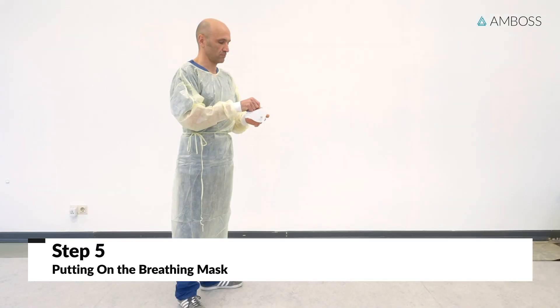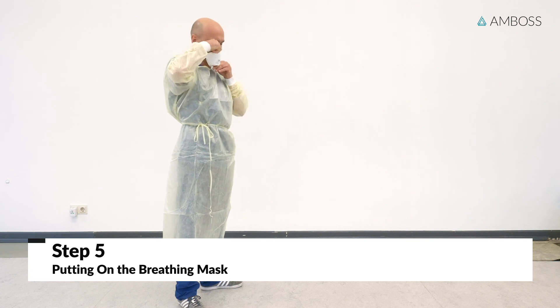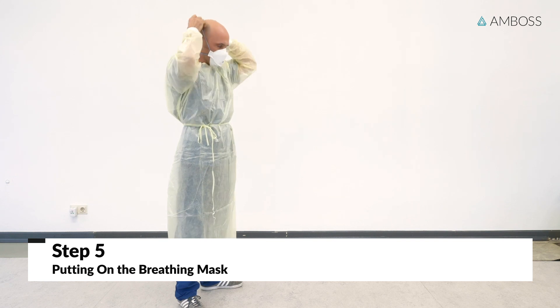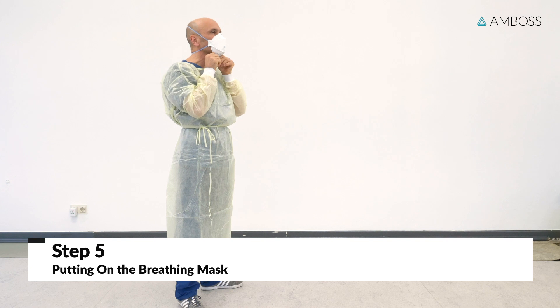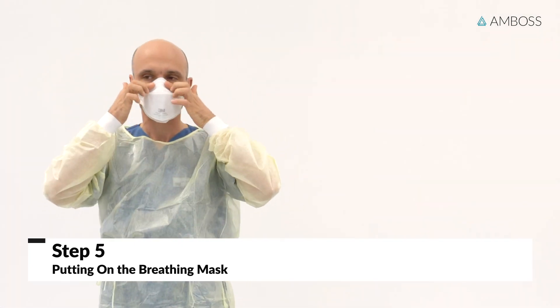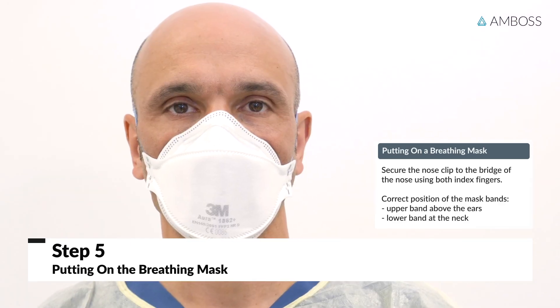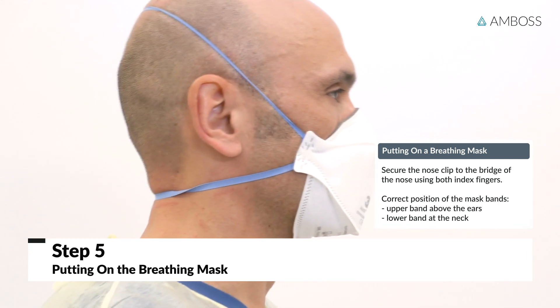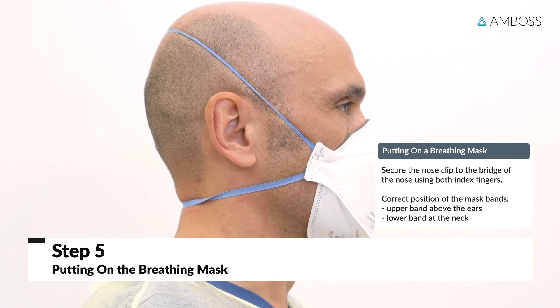Daniel will now show you how to put on the breathing mask. The respirator shown here is an N95-equivalent mask. First, put on the mask so that the nose, mouth, and chin are completely covered. Next, the nose clip should be fitted to the bridge of the nose with both index fingers. The breathing mask's elastic bands should be tight enough to securely fit onto the head. The upper band should be placed in a secure position above your ears, and the lower band should be located at the neck.